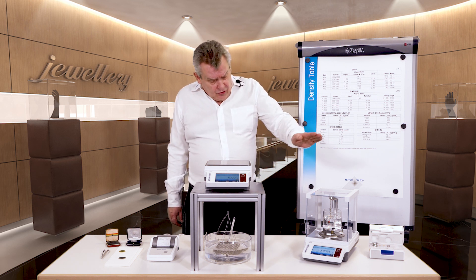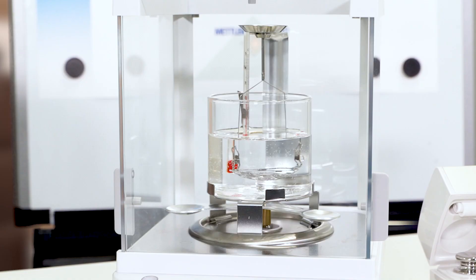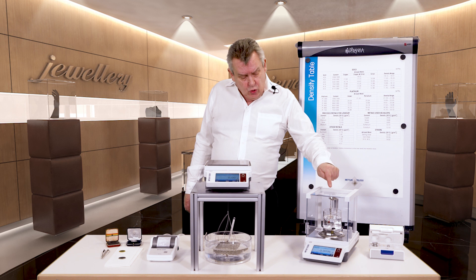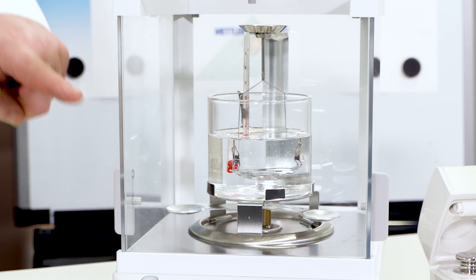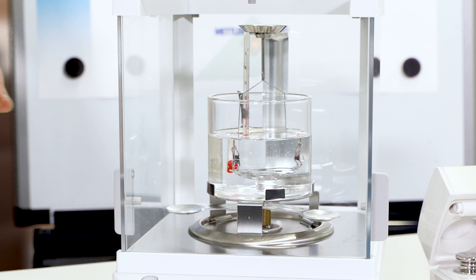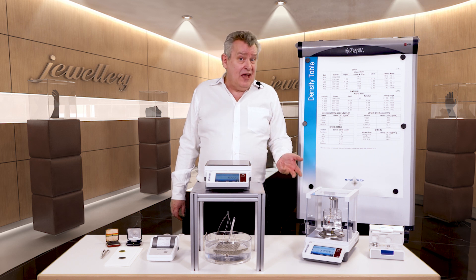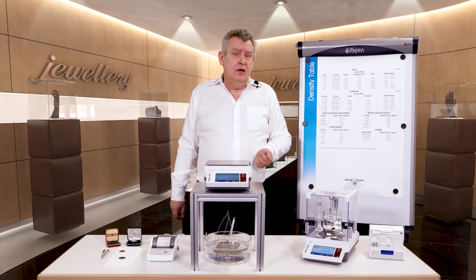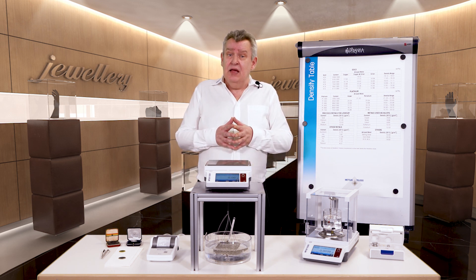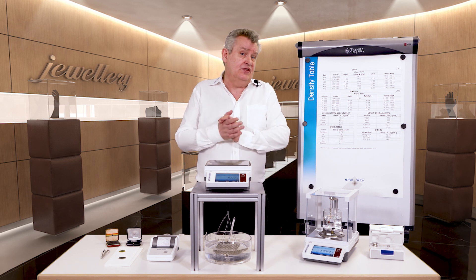This is a high accuracy balance on which I've installed the density kit — this would be for very fine samples. According to Archimedes' principle, you weigh the sample in air and then weigh the same sample again immersed in a liquid. The apparent difference between these two masses will tell us the purity of our solid sample, i.e. its density. You can also measure purity on a balance without using this density kit.